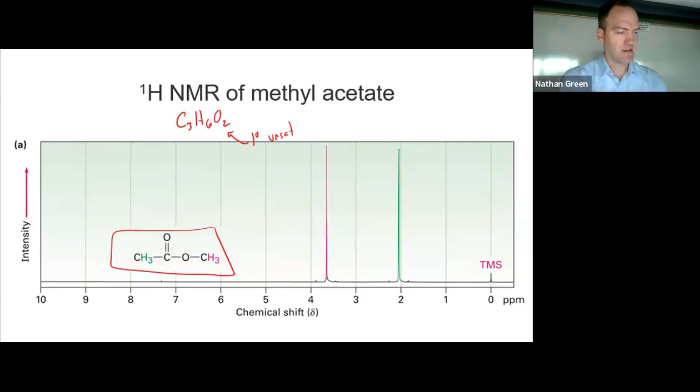I think of that with these NMR signals. All I see are these two peaks. I have to fill in the rest of this because these two peaks mean more than just the protons that are here and here. There are other things that allow the protons to interact together. So what we're going to do is use the three pieces of information from an NMR and take the shadows of the protons to fill in the full molecule.